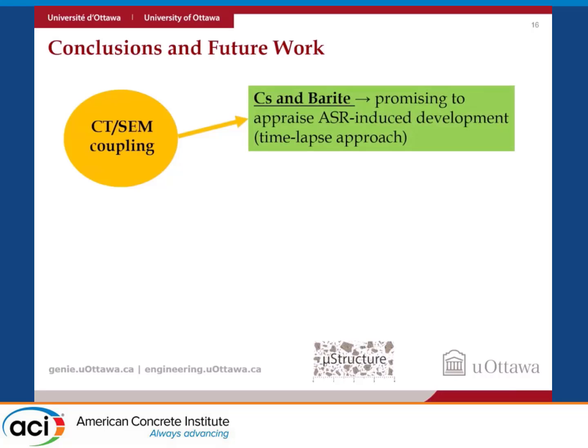one of the preliminary results that we got is that barite and cesium nitrate are very nice tracers. We can compute much better things. By the way, there are 3 papers published out there from EMPA and previous works, and one by myself with Andreas, trying to first of all understand the use or not use of tracers in the computation of CT. You need to use that if you want to be really quantitative. And second, what are the hypotheses for a secondary deterioration of recycled concrete aggregate? All of those hypotheses used in this work, we described a little bit in the previous publication.